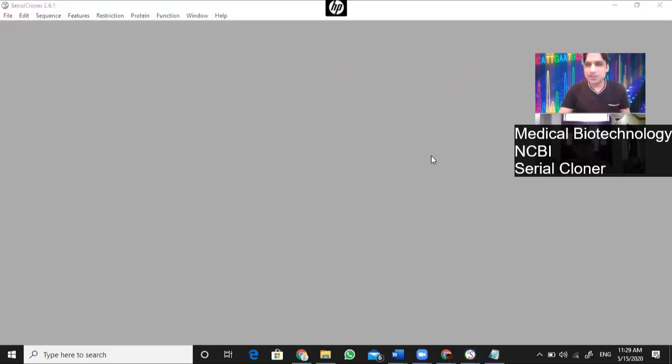They are nothing. These things are nothing. You can do these things manually with your software. Now, for example, this is the same situation. I have two sequences. One is wild type, other is mutated. I can compare them to see.